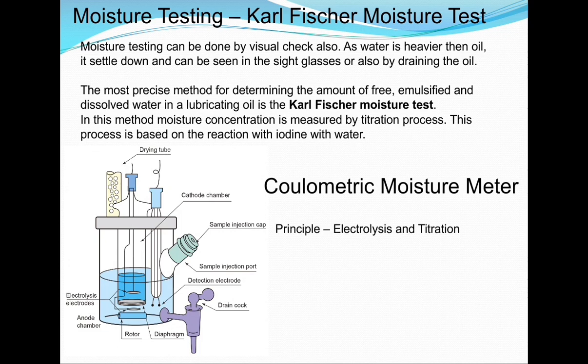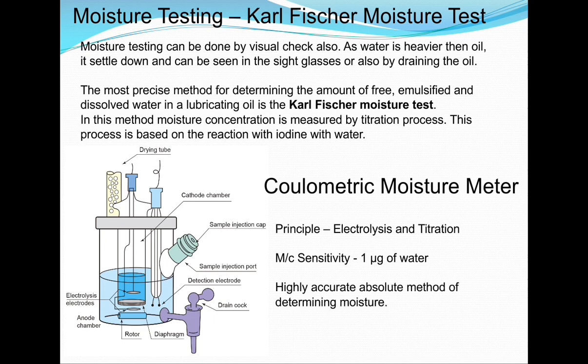And basically the sensitivity of this equipment is very high. It can detect 1 microgram of water also if available in the lubricants. So the highly accurate, absolute method of determining moisture is the Karl Fischer method, moisture test. And you all must be aware of this.